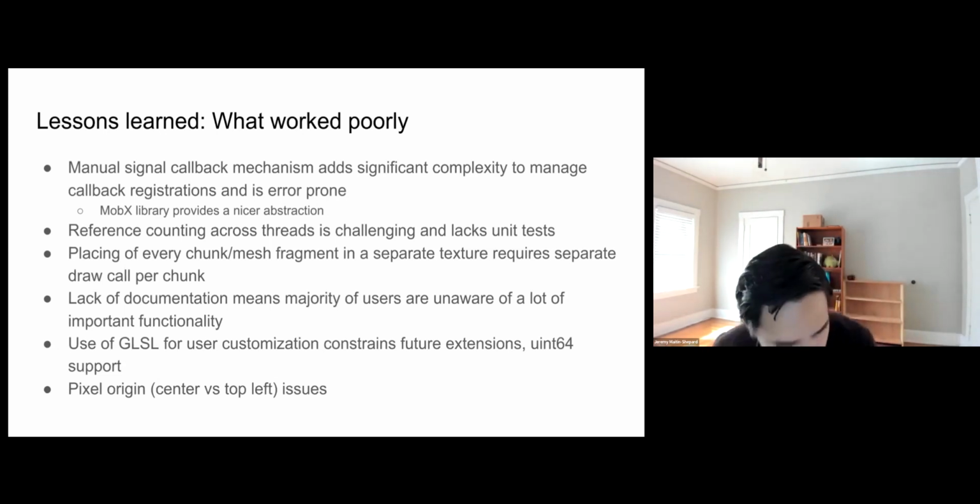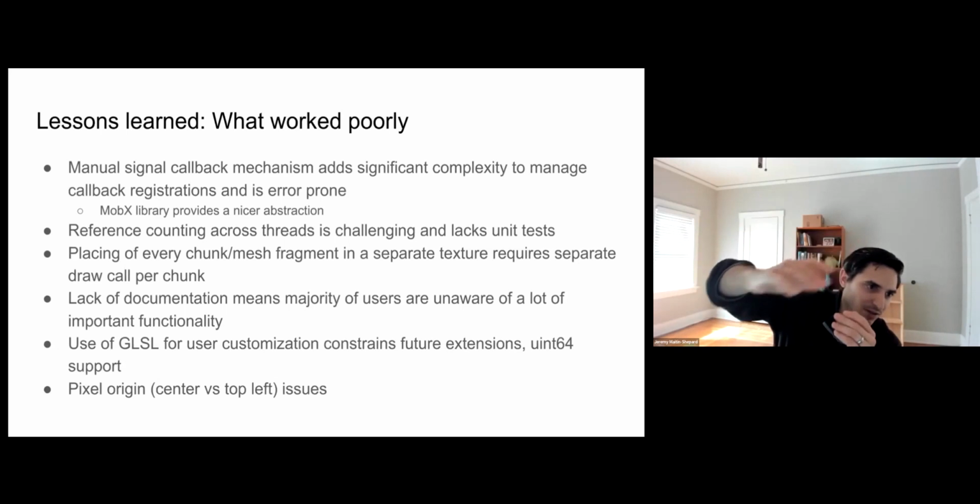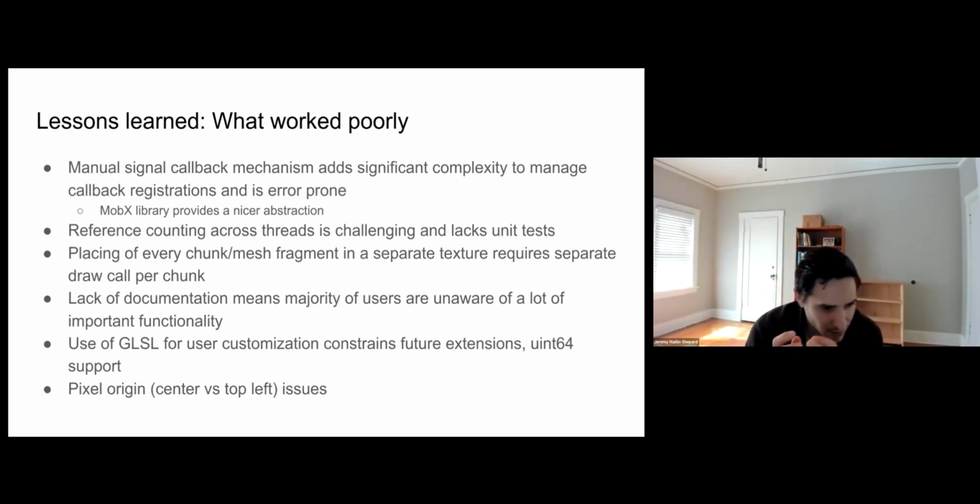So that means that if you look at the 0, 0, 0 point of your volume, your volume begins exactly at that cutoff line. Whereas if you say that 0, 0 in continuous space is the center of the first pixel, then your volume would actually start half a pixel before that point.